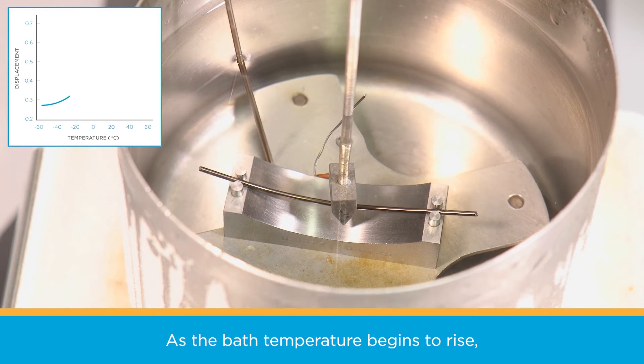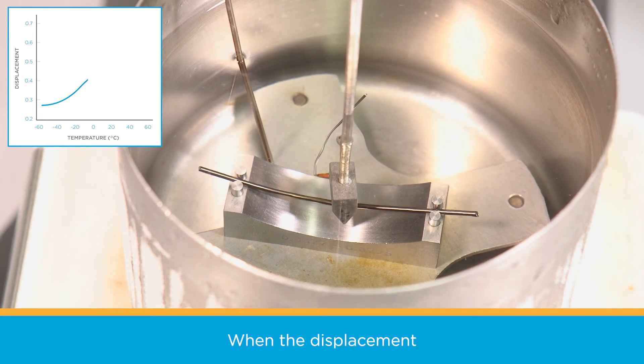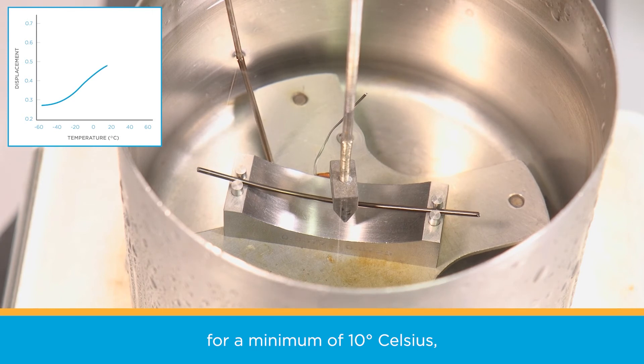As the bath temperature begins to rise, the nitinol will begin to recover its original shape, pushing against the LVDT probe. When the displacement of the LVDT probe stops and the displacement versus temperature curve has plateaued for a minimum of 10 degrees Celsius, the wire has fully recovered.